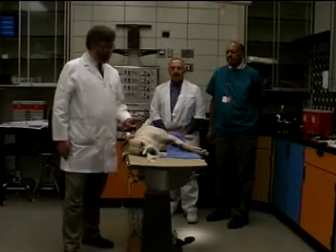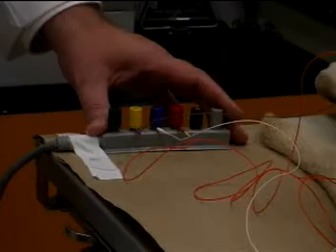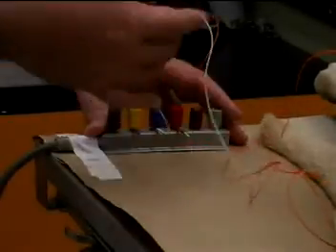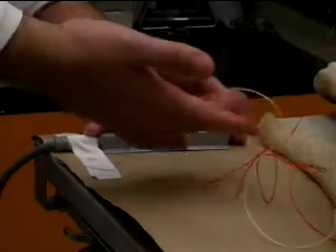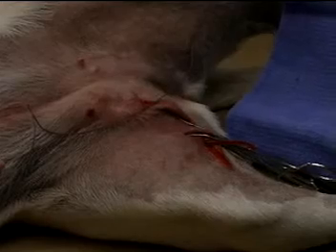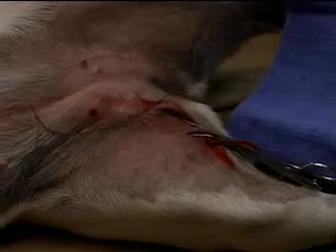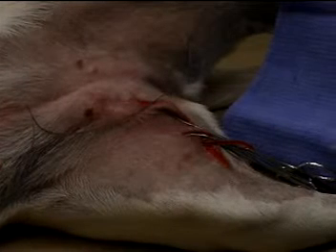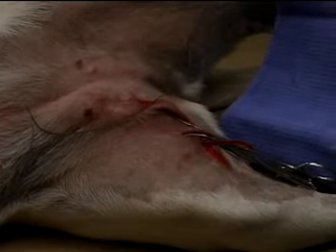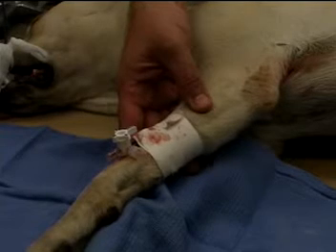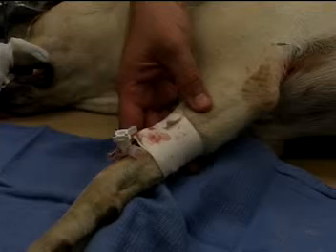We have instrumented her with an EKG lead, so we're recording lead two EKG. We have put a catheter in the femoral artery with which we're going to be recording arterial blood pressure, and we have a catheter in the cephalic vein that we're going to be using for injecting drugs.